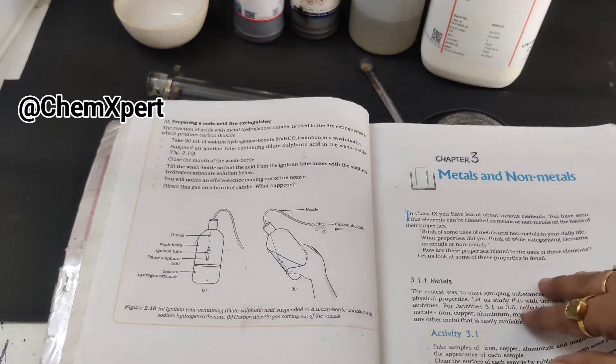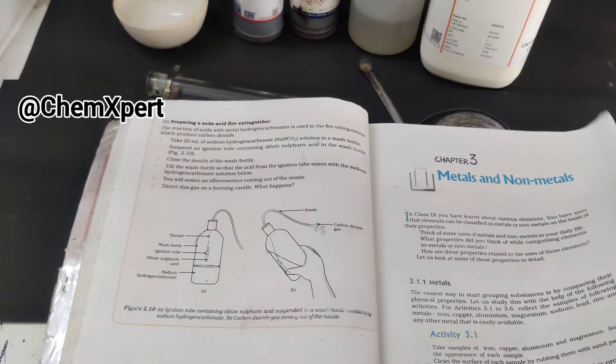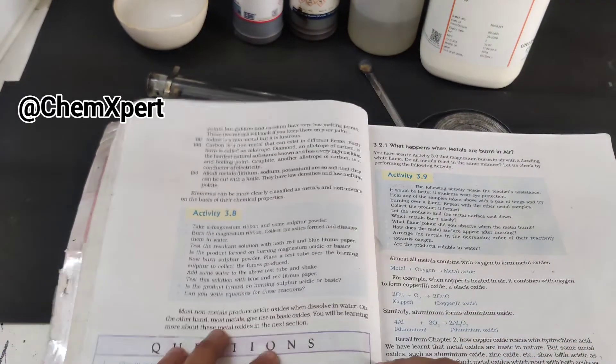Hello everyone. In this video we will perform an activity from chapter 3, class 10 science — metals and non-metals — and this is activity number 3.8.